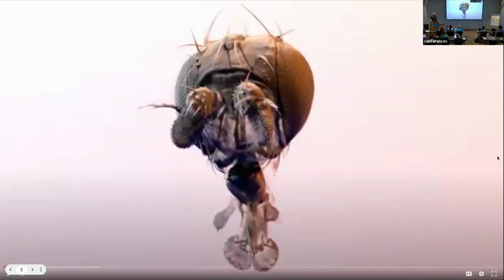Here's an example of this for the Drosophila brain, on the data set that Mary was speaking about. This is a whole data set of the brain. What you see here is the head of a fruit fly, imaged by a colleague in Jena, Germany. It has its two eyes, antenna. This is the mouth part. The esophagus goes straight through the brain. I don't know, I thought that was a good design.